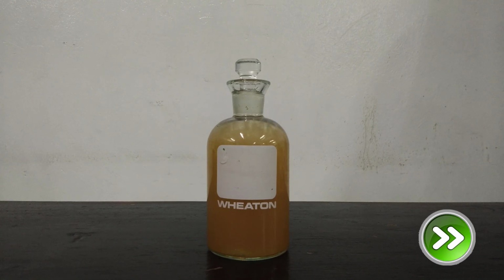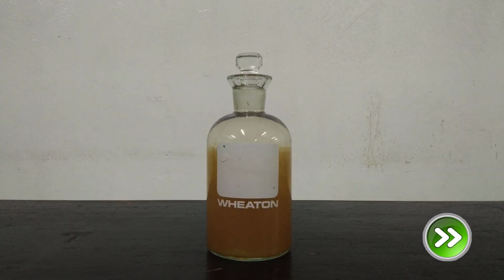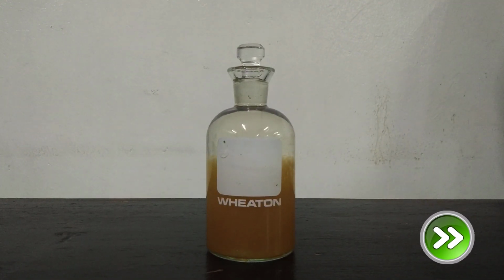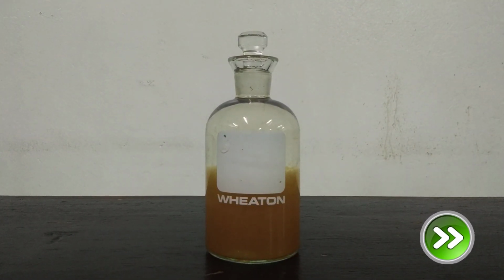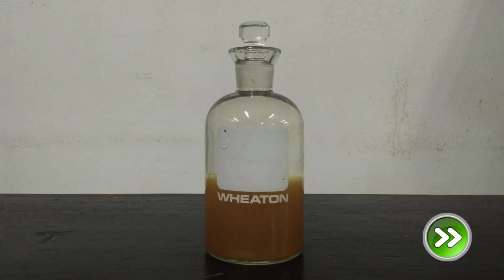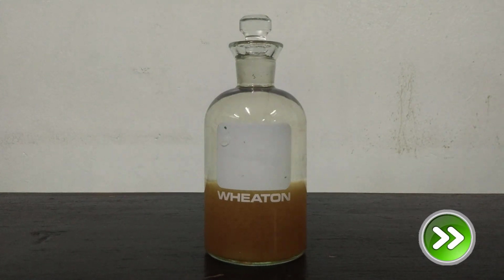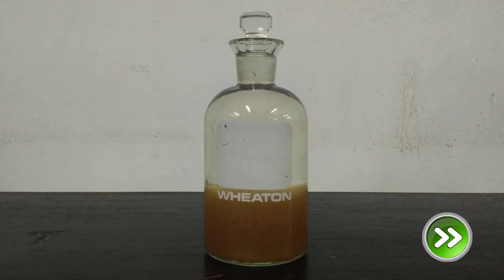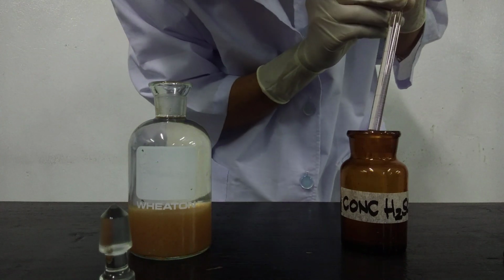Now this will take a few minutes, that's why we will just fast forward the video. If white precipitate is formed, discontinue the analysis. But if a brown precipitate is formed, continue with the analysis. When about 100 ml clear supernatant has appeared above the precipitate, carefully remove the stopper.